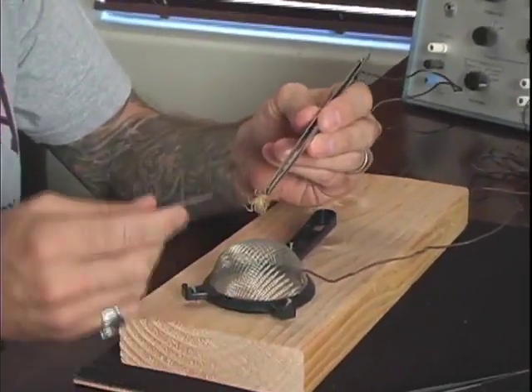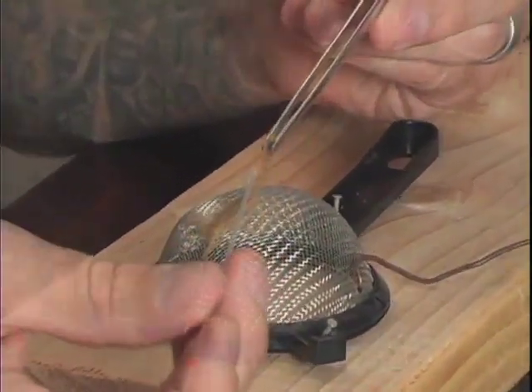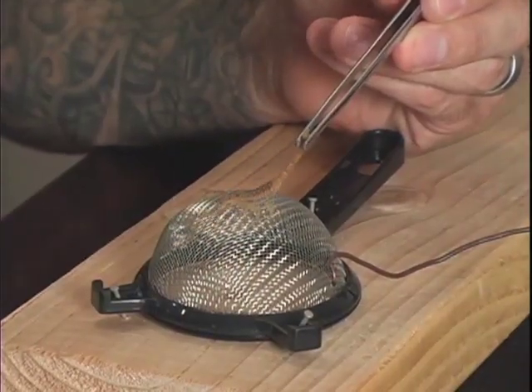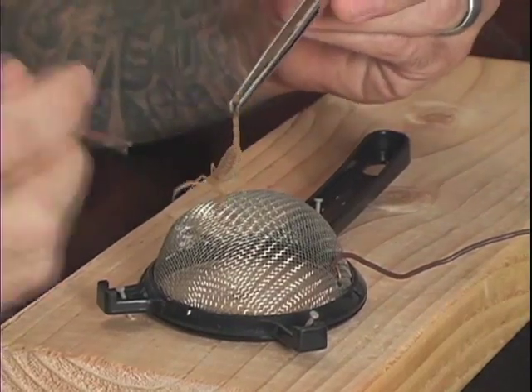Right now there's no stimulation applied to the scorpion, but when I touch it to the T-strainer, it completes the circuit and expresses its venom. Since I do not wish to harm the scorpion with increased electricity, agitating it also helps express venom.